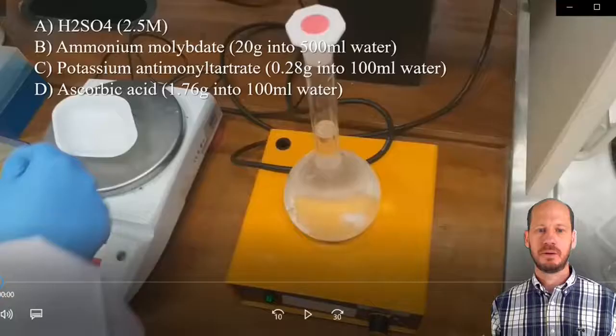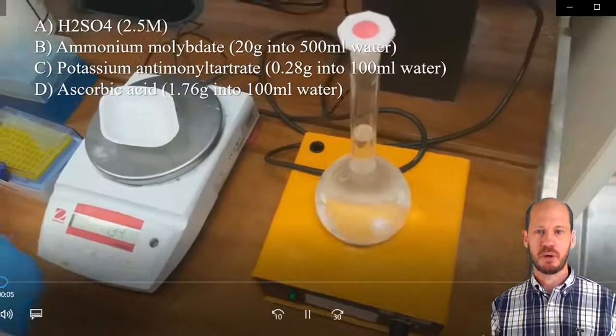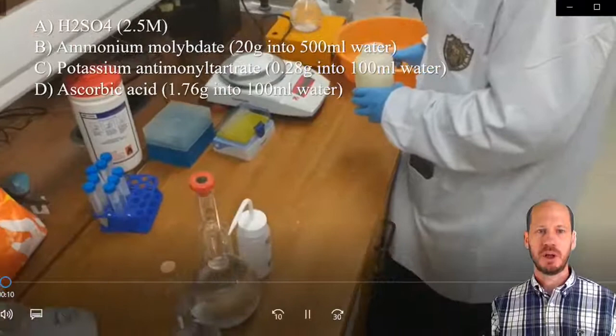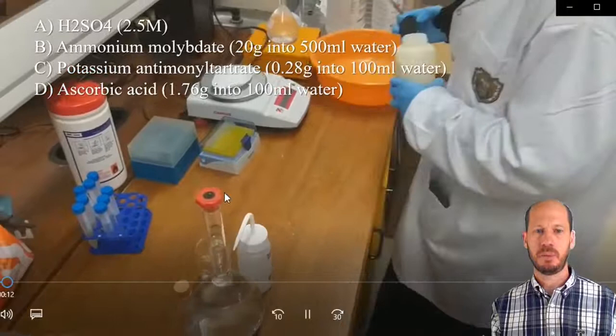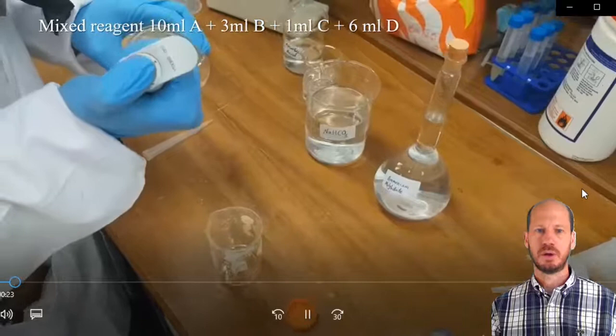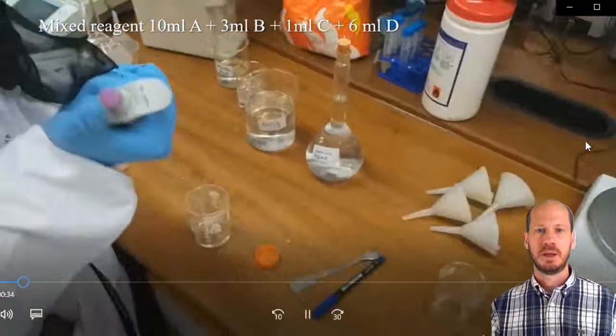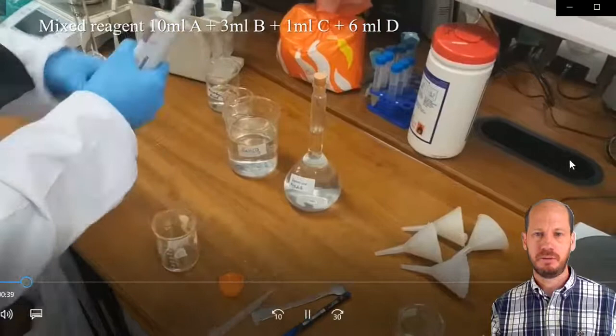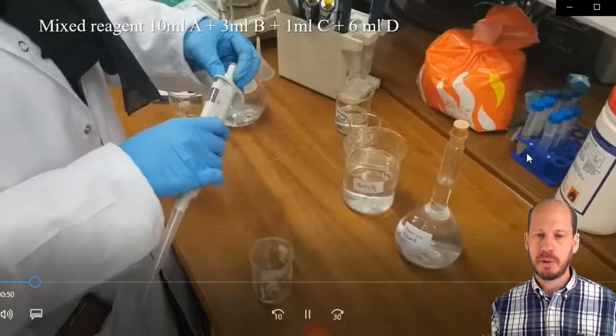First step is to prepare the four solutions for color development. The first is sulfuric acid. The second is ammonium molybdate. The third is potassium antimonyl tartrate. And the fourth is ascorbic acid. Once you prepare these four solutions, you prepare a mixed reagent containing 10 ml of solution A, 3 ml of solution B, 1 ml of solution C, and 6 ml of solution D. The ascorbic acid, solution D, has to be prepared on the day.